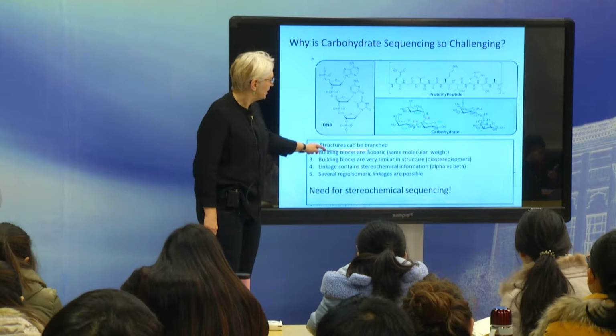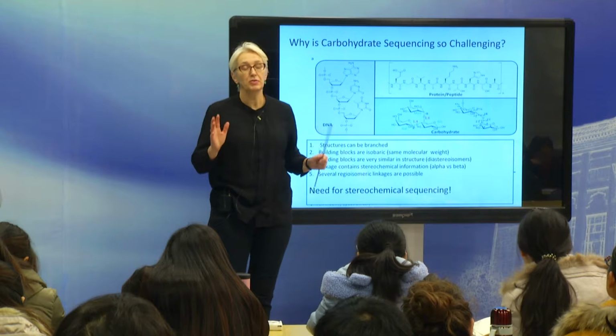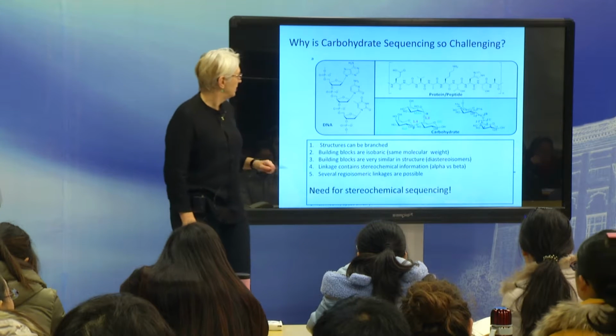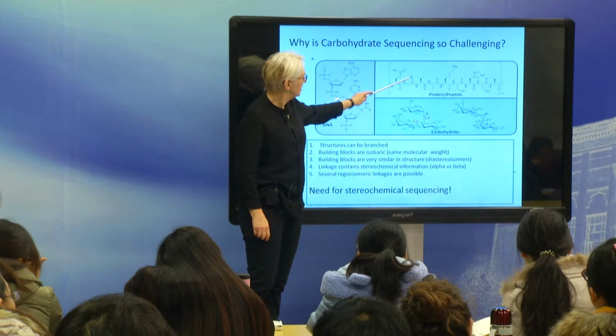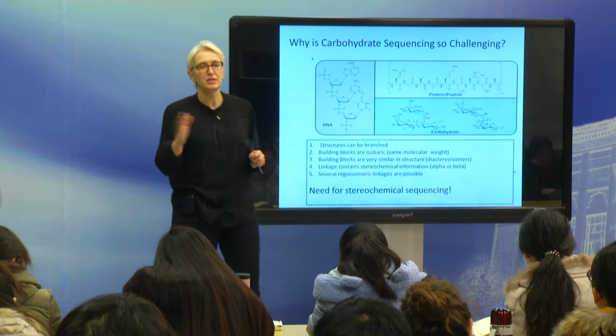The building blocks are isobaric. So I said already, isobaric means a lot of them have the same mass. I said already, what we're using is mass spectrometry often to sequence proteins, and very few of the amino acids have the same mass.